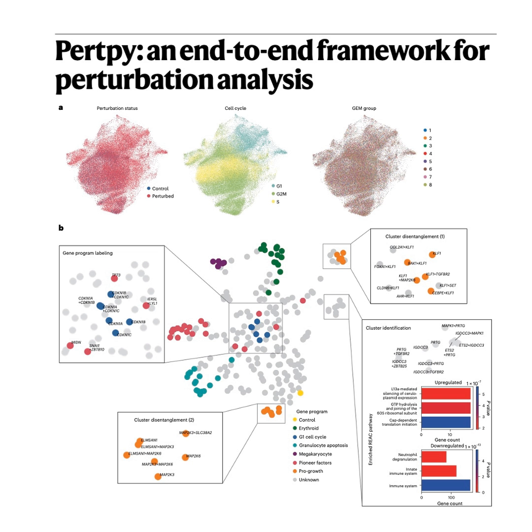So Pertpy is really the full toolbox, from the basic gRNA assignment all the way up to these complex intercellular communication metrics that can generate clinically relevant hypotheses. That's the big picture. It takes all these powerful tools, many of which were stuck in R or were too slow, and brings them into this fast, interoperable Python and scverse ecosystem. And it's all built with future scale in mind.